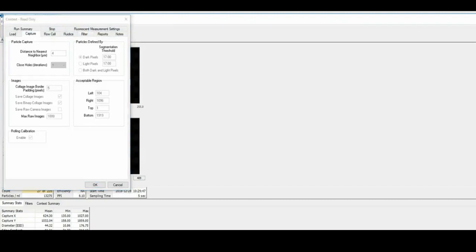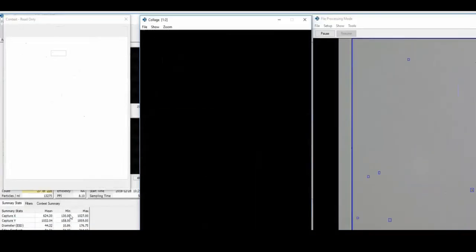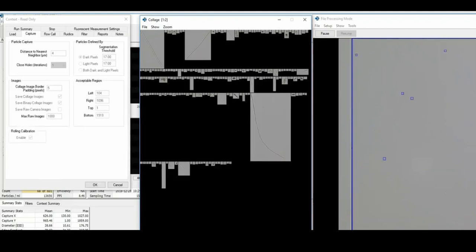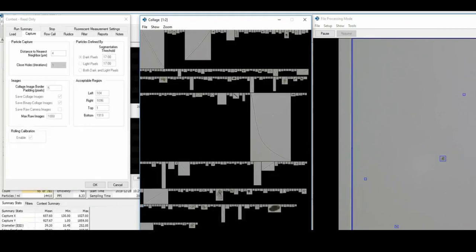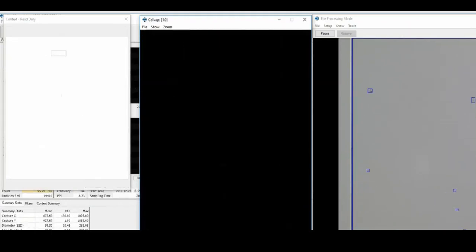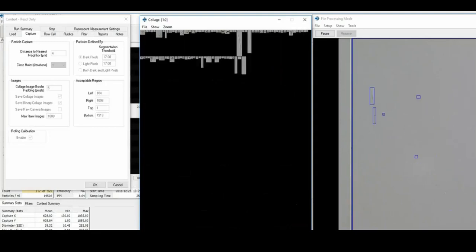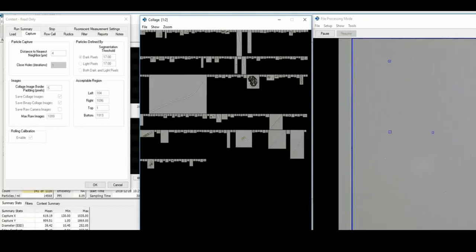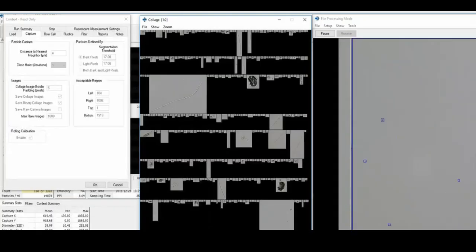You can observe how the image capture changes with the raw capture and filter settings. While you will be able to replay your list file, you cannot refocus your sample after it's been acquired. So just keep this in mind while setting up your system for running file processing mode. You can view the context settings that you changed by launching context, and the values will be grayed out.